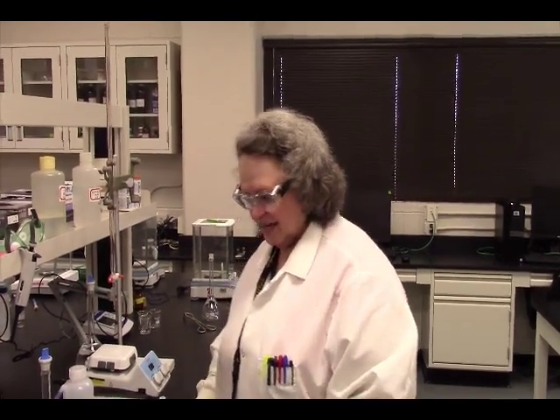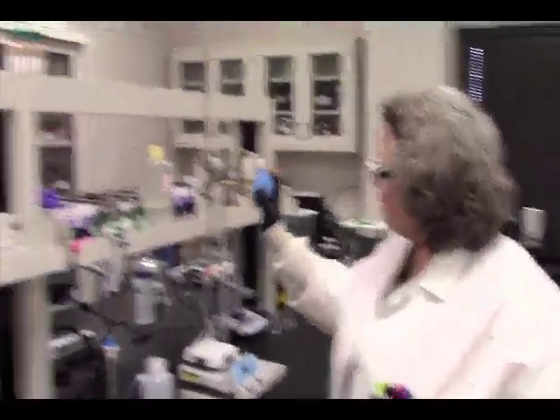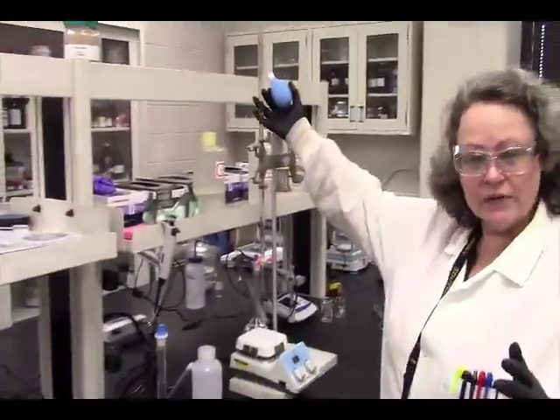All right. We are going to be analyzing Clorox, or sorry, the amount of bleach that's in different Clorox samples. We want to know if there's a statistical difference between the sodium hypochlorite that's contained in a generic brand versus a Clorox brand. And our generic brand happens to be Great Value, Walmart, right? To do that, we are going to have to standardize our sodium thiosulfate solution.